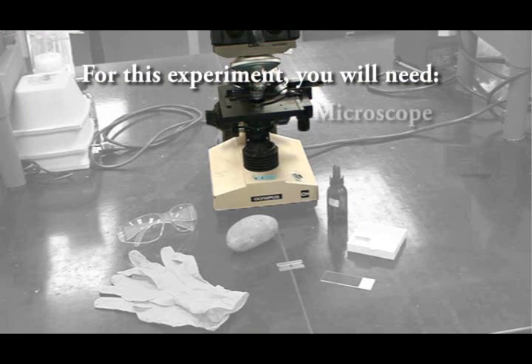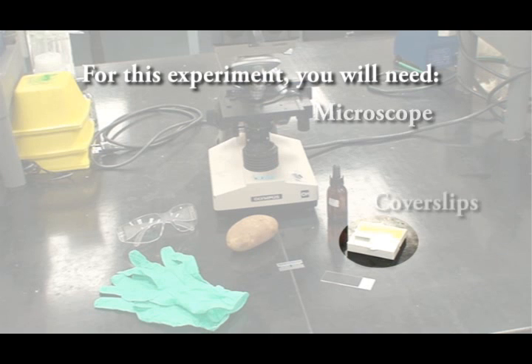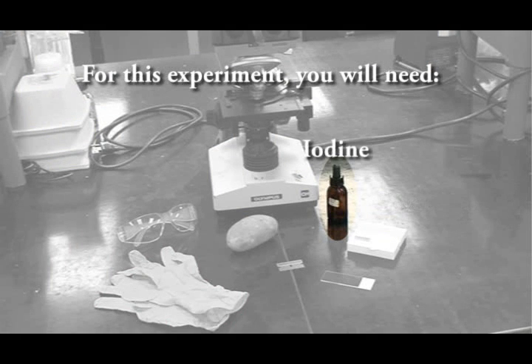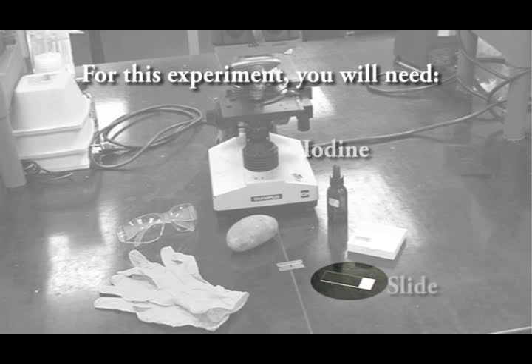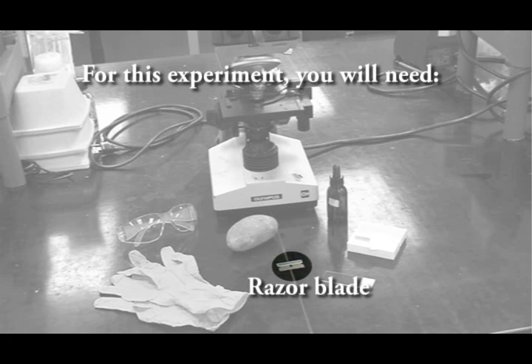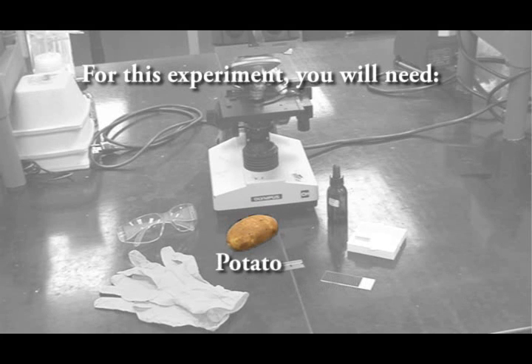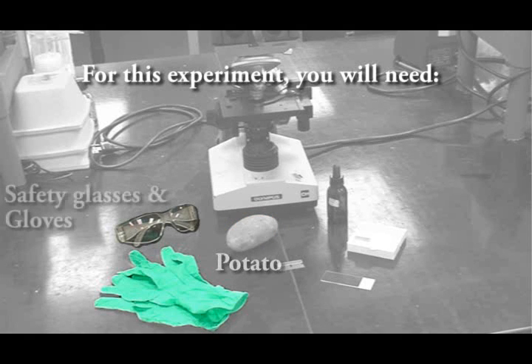a microscope, cover slips, iodine solution, a slide, a razor blade, a potato, and safety glasses and gloves.